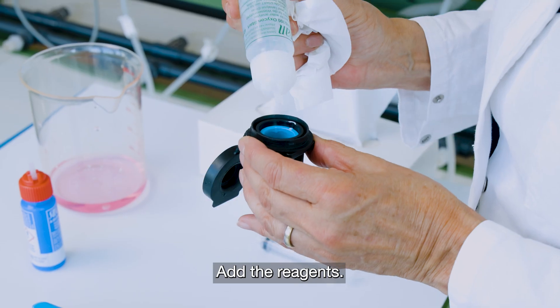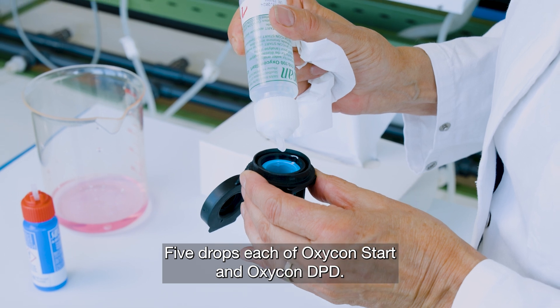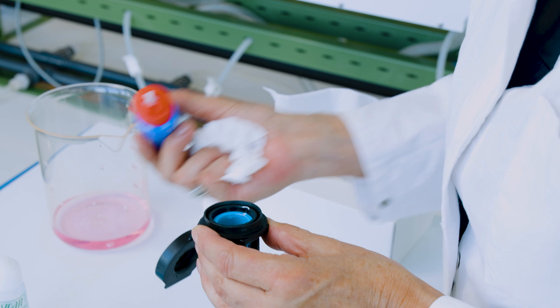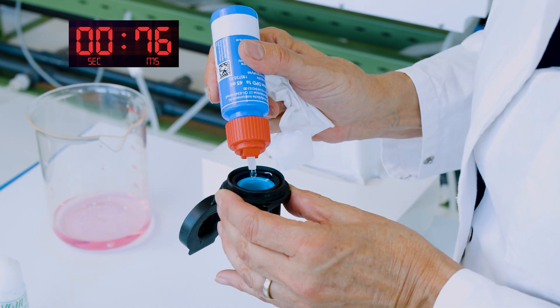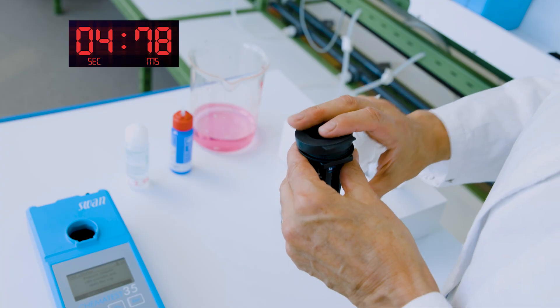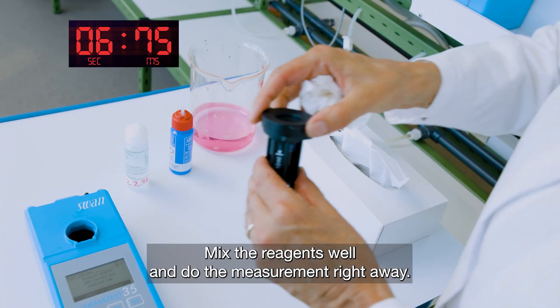Add the reagents — 5 drops each of OxyConstart and OxyCond DPD. Mix the reagents well and do the measurement right away.